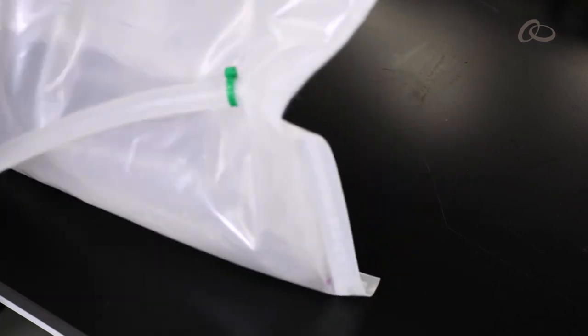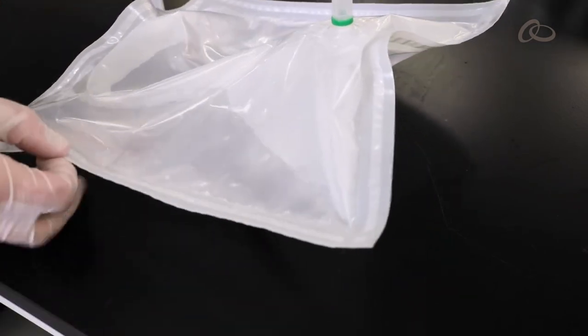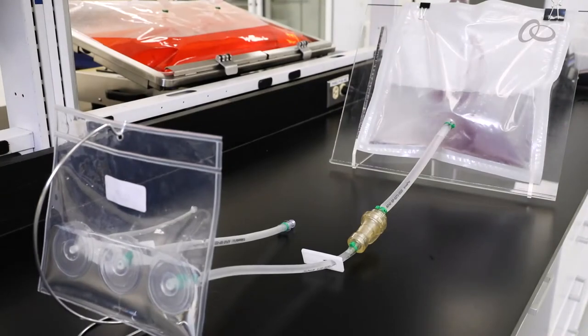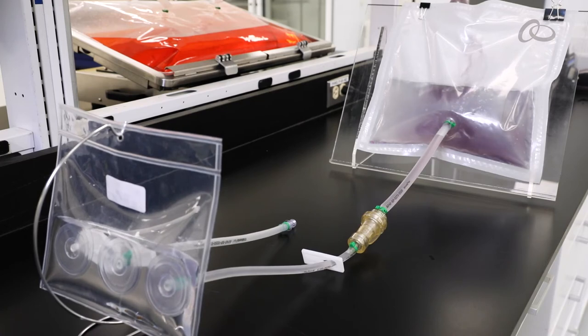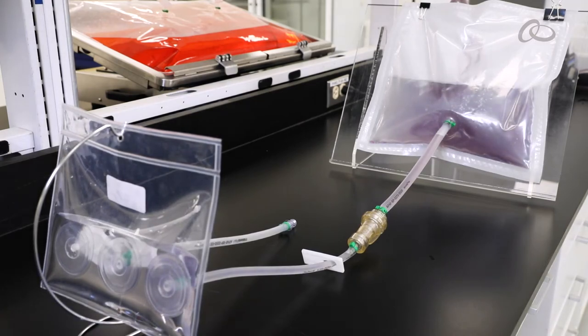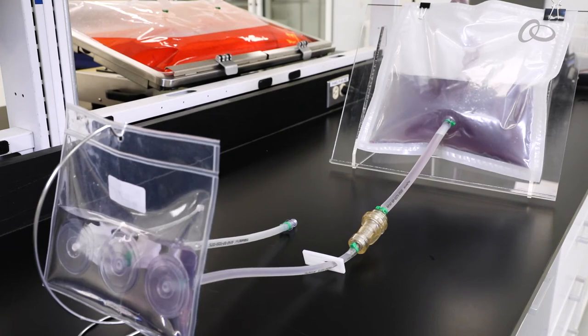The Integrus micro carrier separation bag is a customizable, economic solution for harvest. The maximum throughput and flow rate are dictated by the size of the bag, which is typically available in sizes from 500 milliliters to 20 liters. Our application specialists can tailor the bag to your location, including the number and placement of ports.